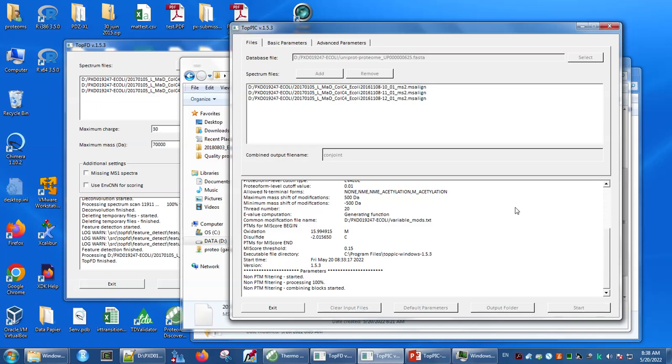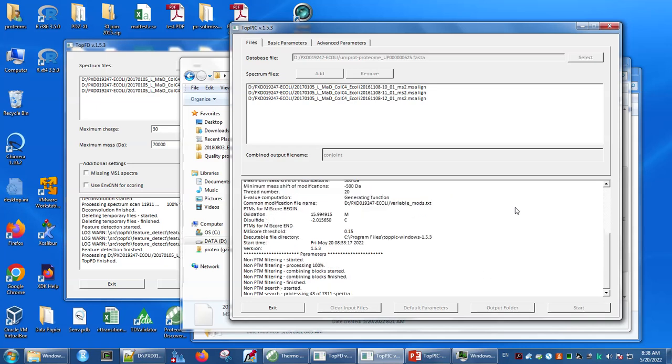It's not simply caching all of it in RAM, but rather doing a lot of this filtering through indexing on the sequence database on disk. As a result, if you were able to do this search from an SSD, a solid state drive, rather than a spinning hard drive, you would likely see a much better throughput for the search. So having large numbers of CPU cores is great, but it's often better to have good I/O throughput, better disk throughput.